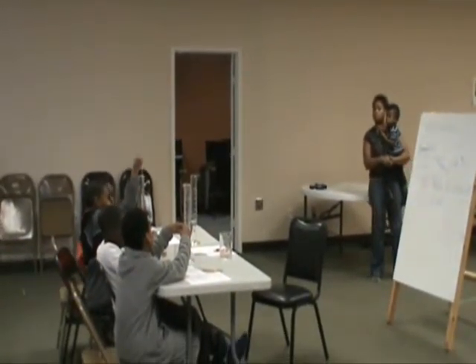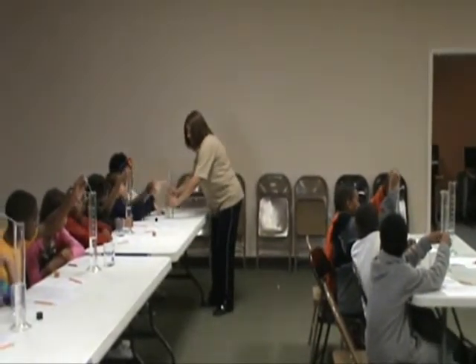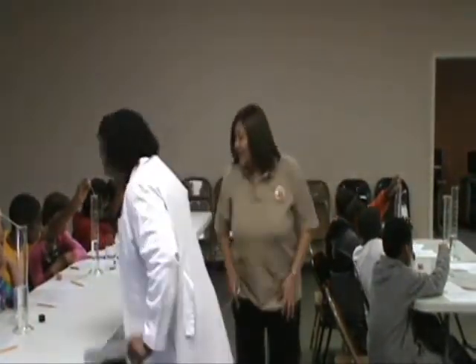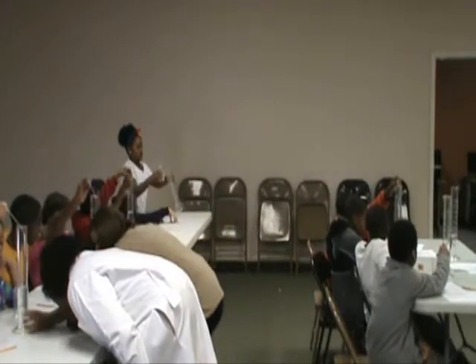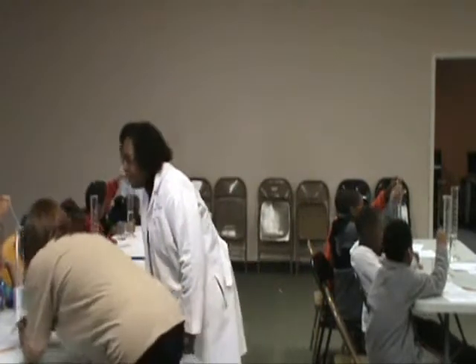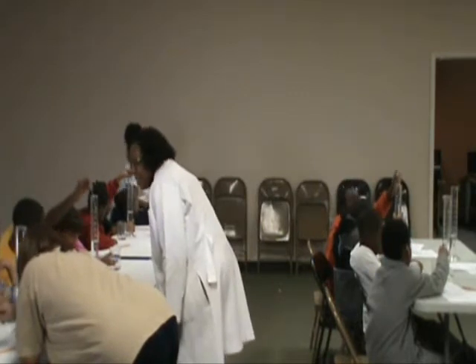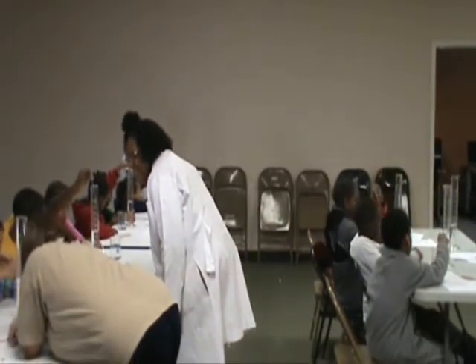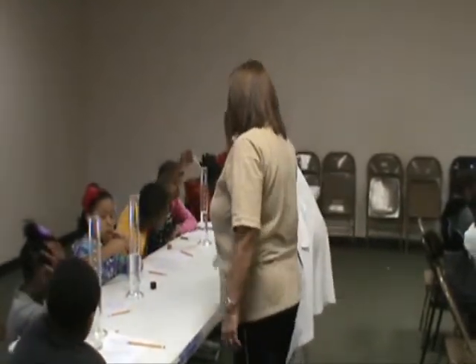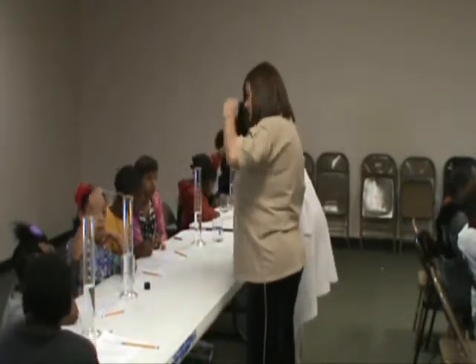Uh-oh, pipette. Well, things happen. We just start all over. That's okay. I'll get you another pipette. What you got? Okay, now, little lady, what she's doing, she's dropping these drops in here to make sure that it comes on top. You want to drop some of them in? Why not? She knows how to do it too. She explained it to me. All right, well, come on then.